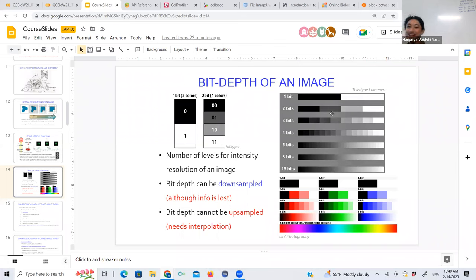So in any case, we're going to come to color. So far I've just been talking about black and white and grayscale levels. Color is pretty simple. You just measure at three different wavelengths, blue, green, and red, and you measure intensity in each of these, and that gives you color, the combination of intensities in each of red, green, and blue.